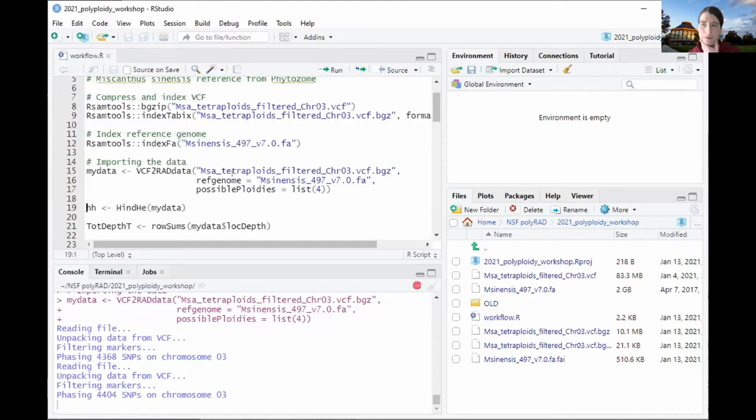If you export to a matrix of posterior mean genotypes, by default, it will just omit the most common one, kind of using that as a reference. I believe when we export back to VCF, it will look at the reference genome again in order to figure out which alleles are really reference alleles.